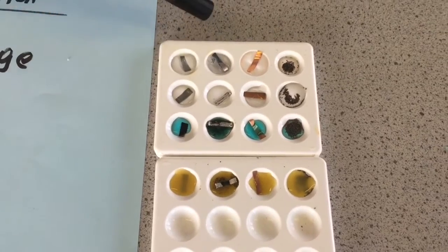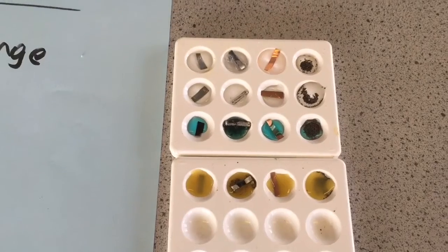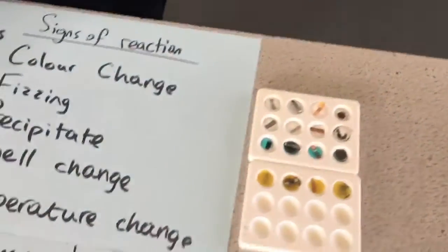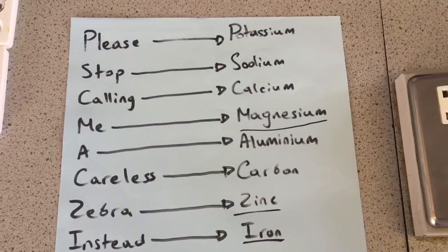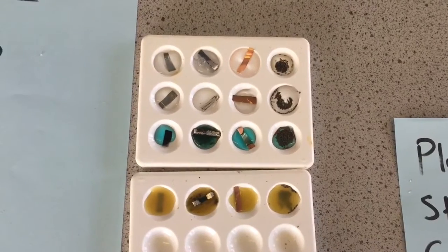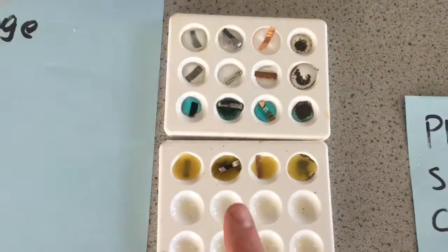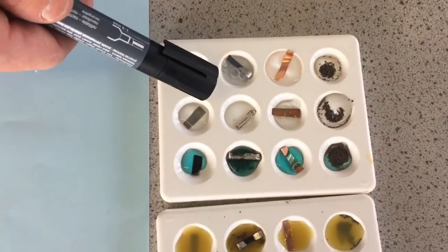We got some bubbles, okay, so we're producing a gas there of some form. Now, magnesium, we looked at our reactivity series. Magnesium then is the 4th most reactive metal. So we should see a reaction fairly quickly. Now, if we took our time and we were really patient with this, we would begin to see other changes, okay? And this is magnesium right by here, yeah? Magnesium, row number 2. So the only one where magnesium is not reacting is the second one.